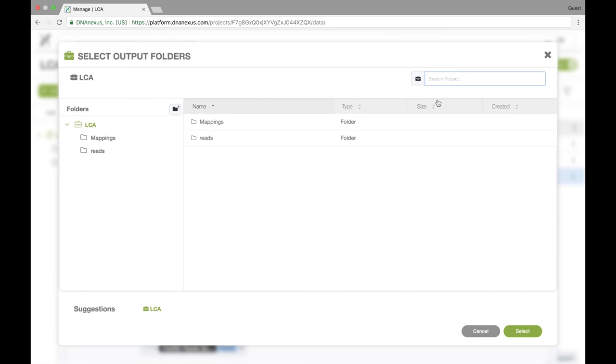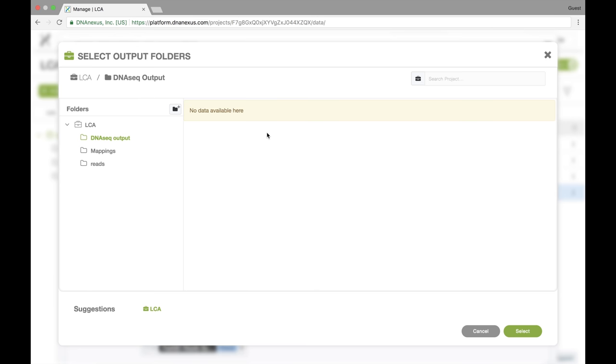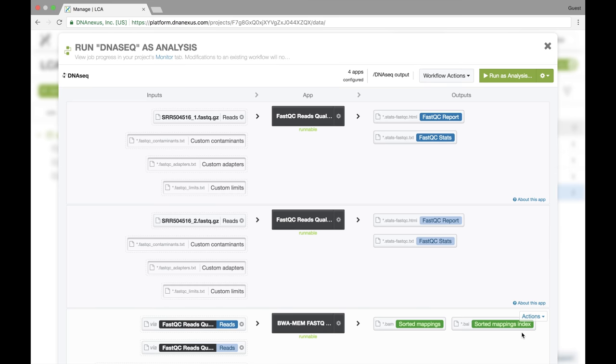So now we're in our LCA project and we're going to create a new folder and we'll call it dnaseqoutput. And currently it's an empty folder. We'll select it to be the output folder for our workflow.